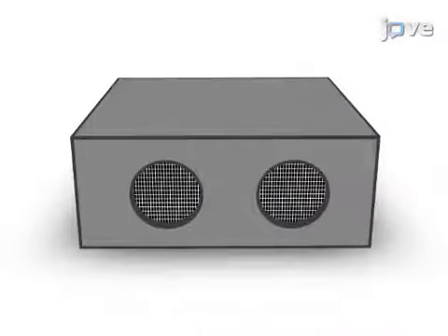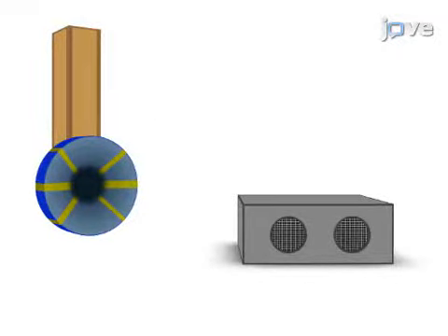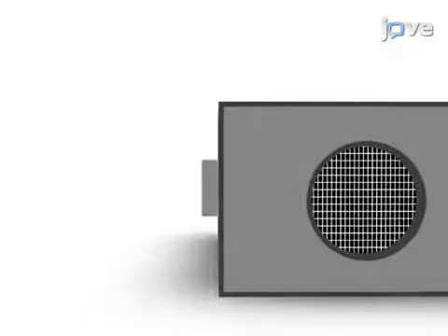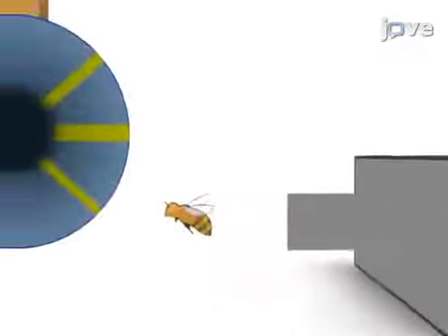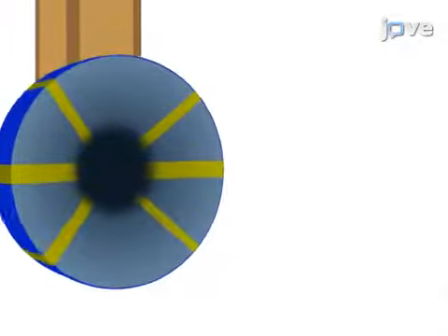The second step is to set up motion-sensitive camcorders or the RFID readers in the testing space. Next, the artificial flowers are placed in the testing space. The final step is to give the bee colonies access to the testing space. Ultimately, a large database of records is generated, consisting of the time and location of each and every floral visit.